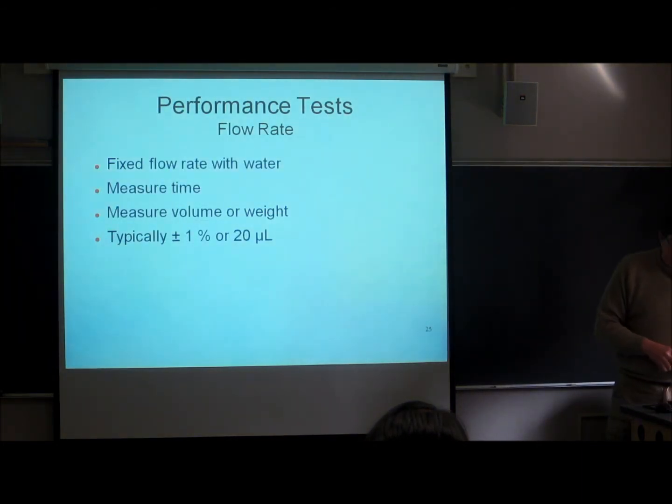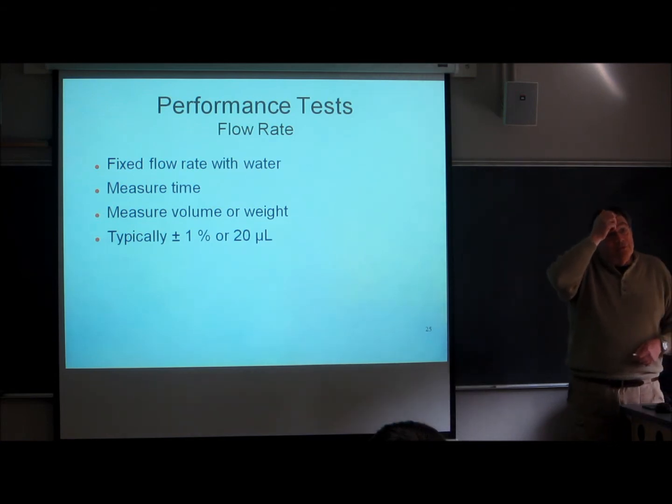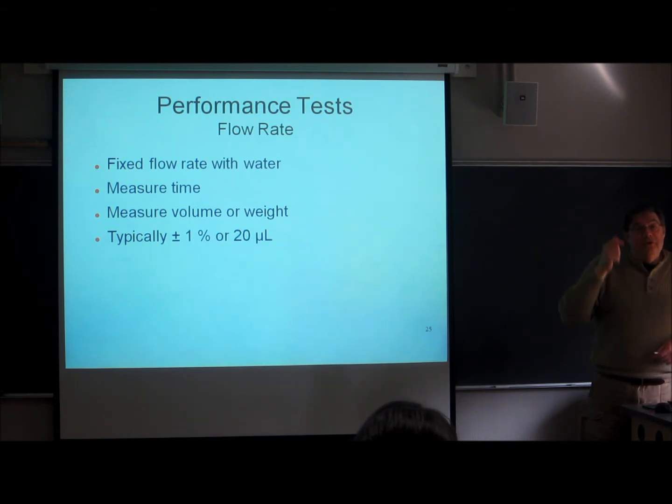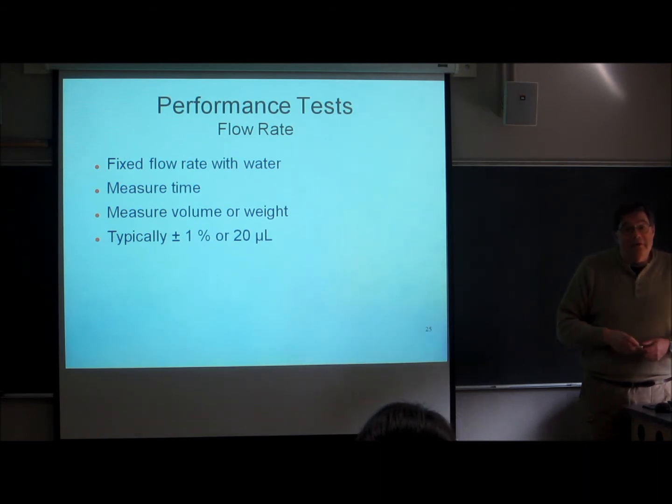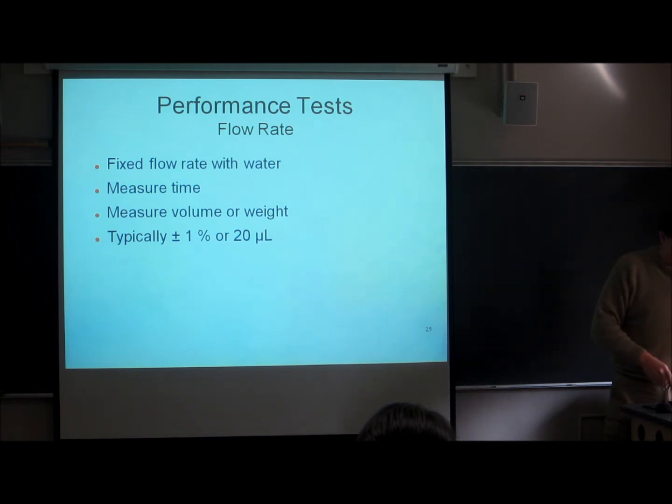A little bit about performance tests, and then we're done. These are tests that we run to see if everything's working right. In industry, they have to be done pretty frequently because the stakes can be very high. You have to make sure that you're not looking at bad data, because you have a product you're trying to sell to somebody, you have to guarantee that product to somebody. So you have to be very careful about this.